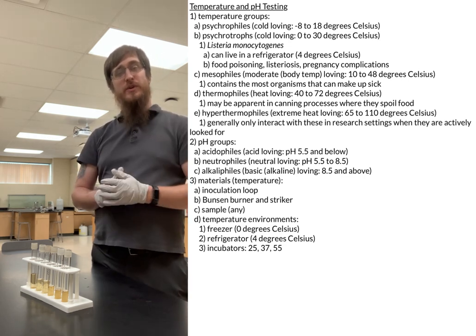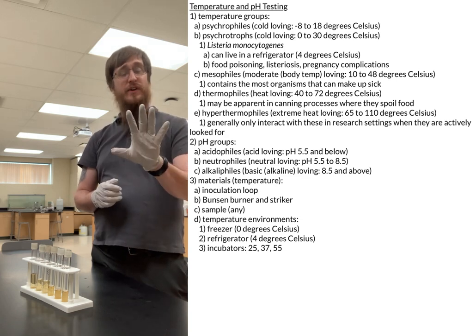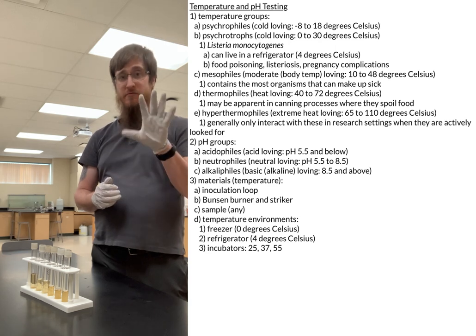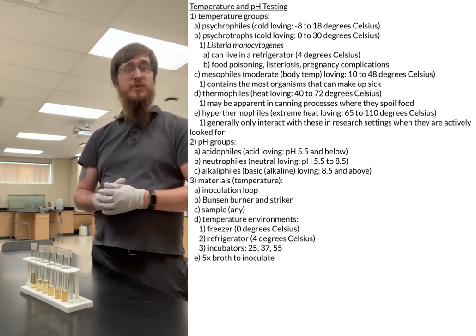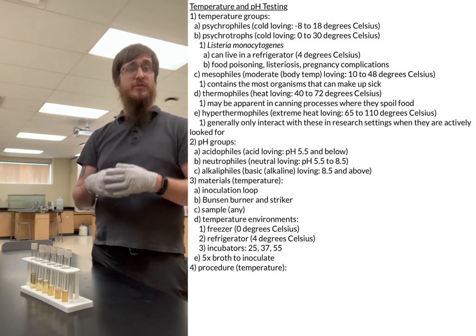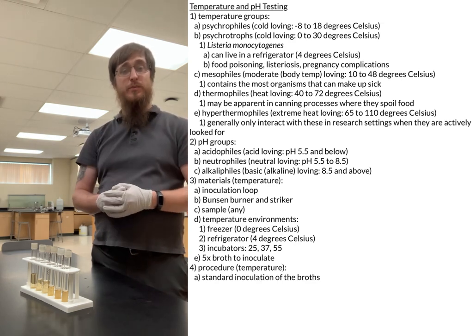So in order to do your temperature testing, you will need those 5 environments. The last thing you're going to need is 5 broths to do your testing with. And the basic procedure for it is that you're just going to do a standard inoculation of those 5 broths.